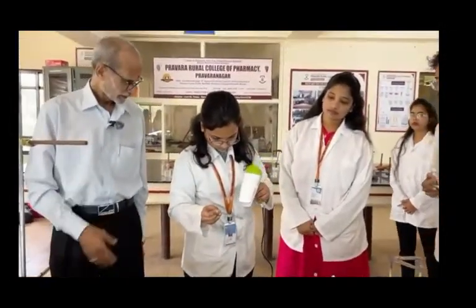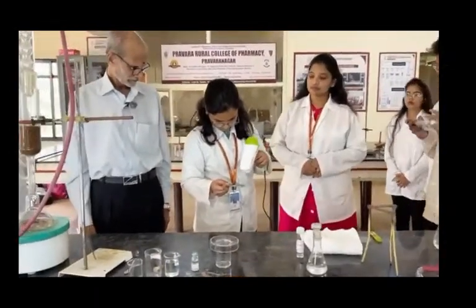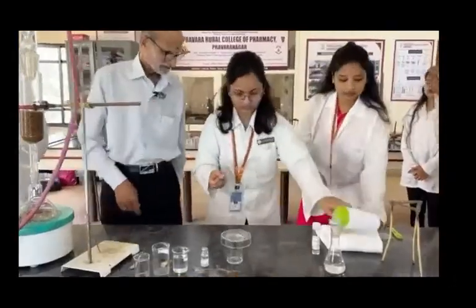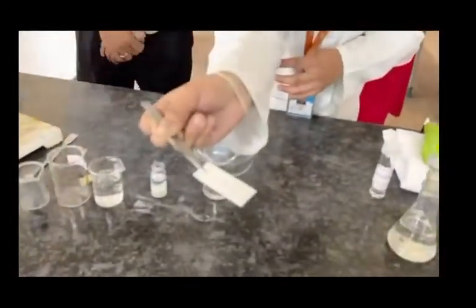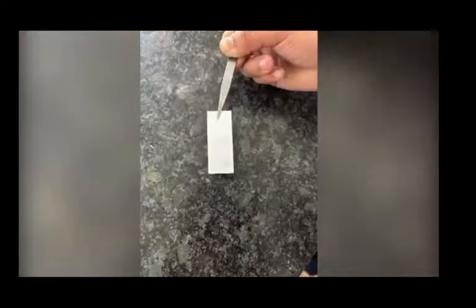So now you can see here, the succinate powder has been put here, and now the succinate will be run. In the meantime, I can come closer and see. The TLC developed is ready now. Again, not very clear, I'm sorry, but you can see the spot here and the corresponding spot here.